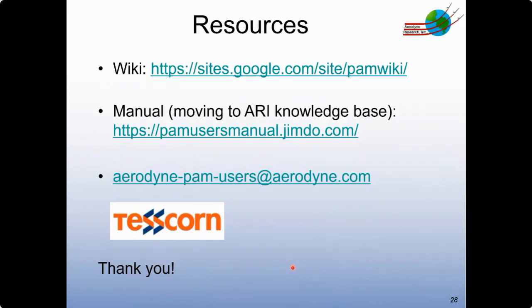And I think my answer to that question is I don't see why it couldn't be done. This user was asking specifically about sustaining humidity at 95% relative humidity or something like that, I think. And I don't think there's any reason why it couldn't be done, but it certainly has not been a focus of other research groups to this point that I know of.